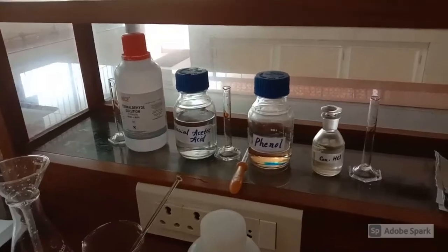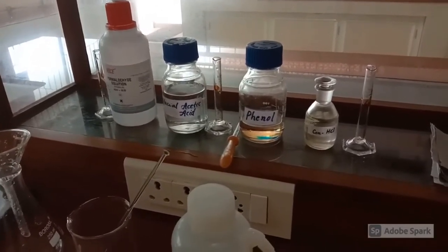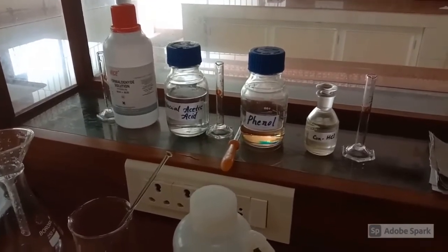Dear students, our next experiment is the preparation of Phenol Formaldehyde, or Bakelite.